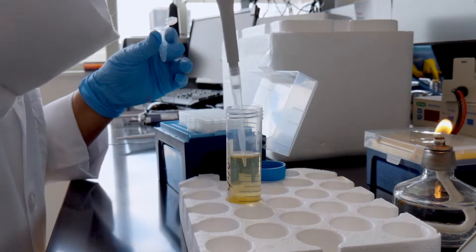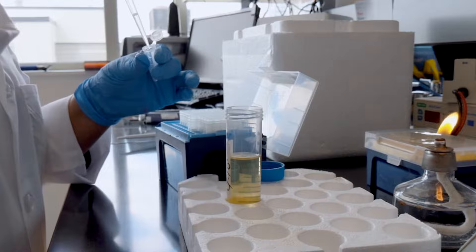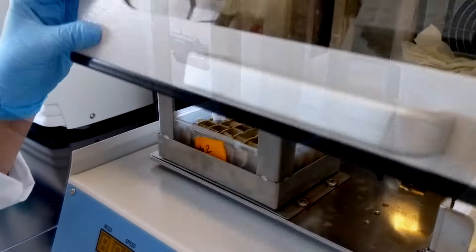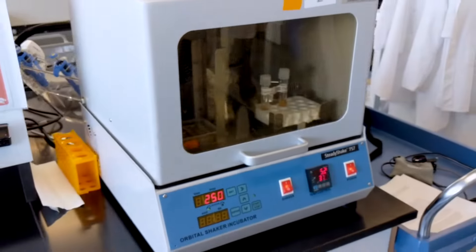To start the outgrowth step, first add 500 microliters of SOC to the tube containing the transformed bacterial cells. Next, place the tube in a shaking incubator at 37 degrees Celsius for 45 minutes.